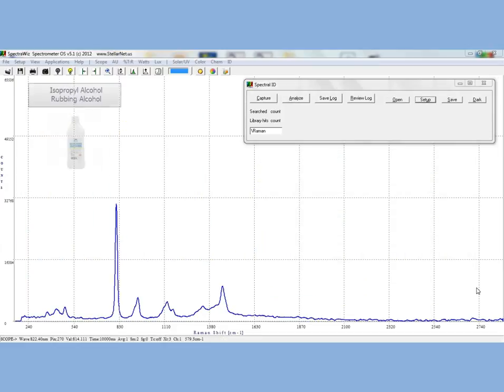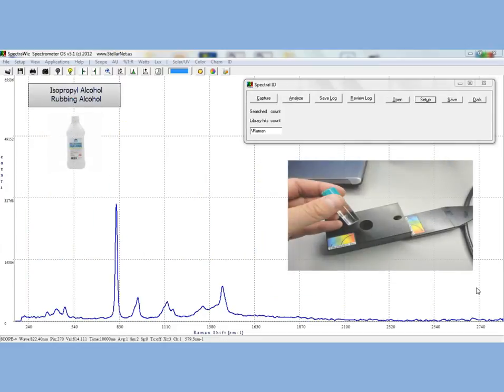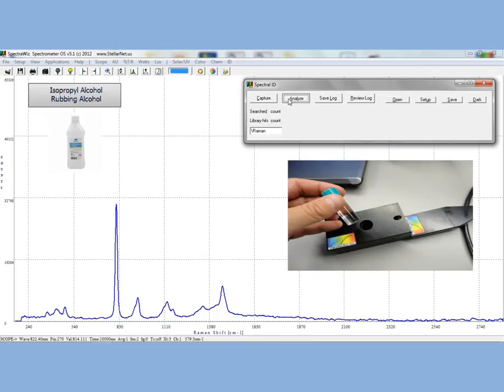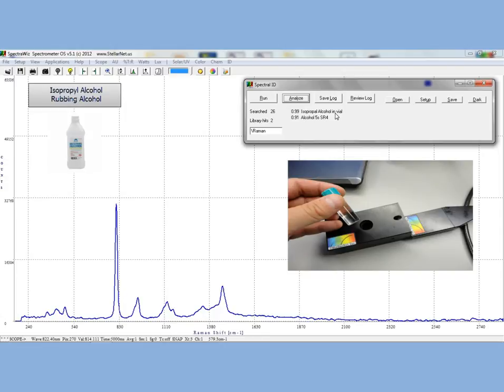Okay, now let's look at some liquid samples. The first sample we will look at is isopropyl alcohol, also known as rubbing alcohol. I have filled my vial with isopropyl alcohol and I fire my laser.